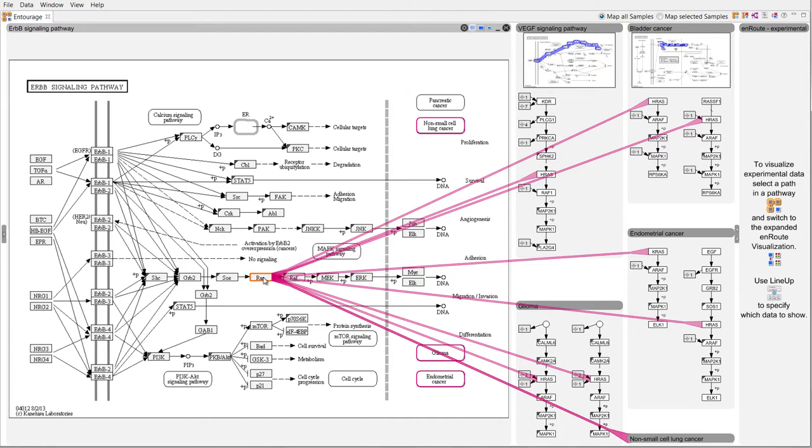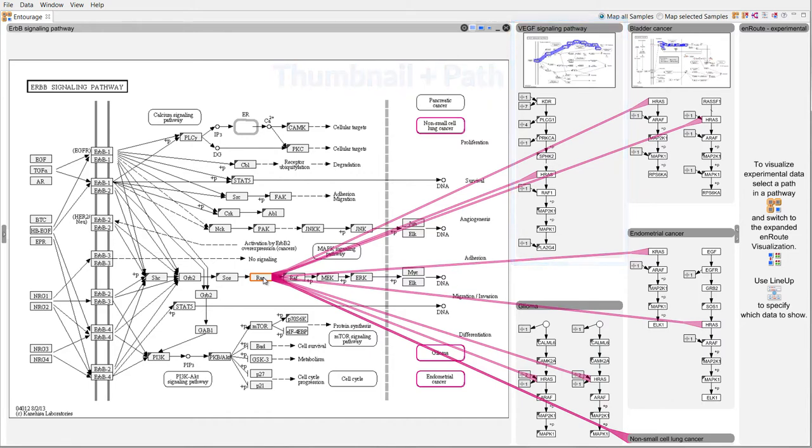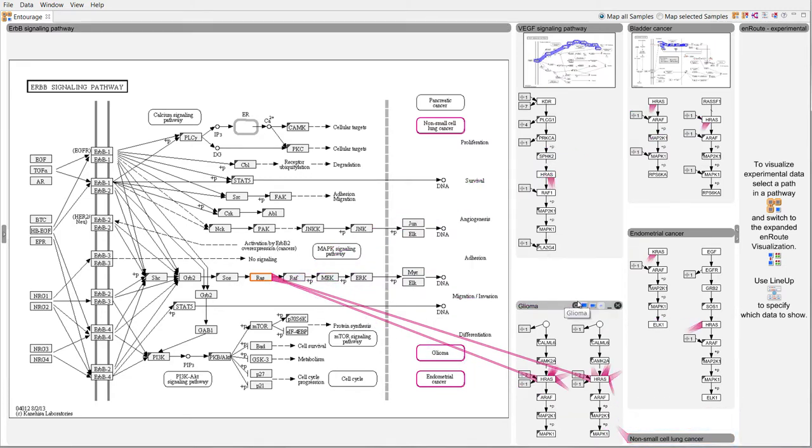Context pathways adapt to the available screen space. They show a thumbnail of the pathway map if there is ample space or are collapsed if there is no space left. Pathways can be brought into focus at any time.